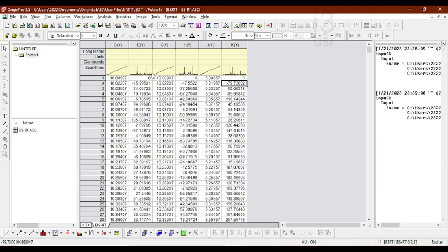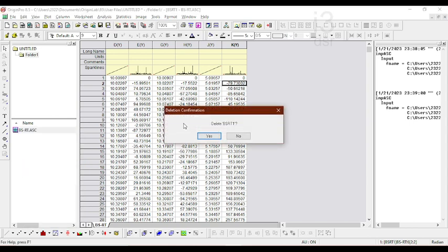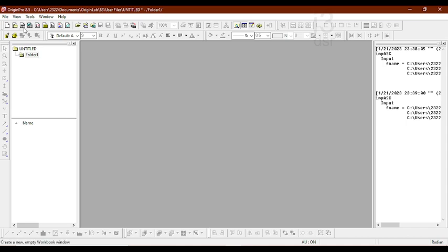So this is the first step which you have to take. If you don't do this, you have to copy data from each table or each sheet and then put it in a new sheet, which will be a tedious process and will consume a little of your time. So to avoid this, this is a method. Now I'll delete this and again create the new file in a very clear way. Please observe it carefully. So I'm deleting. So this is the fresh page.